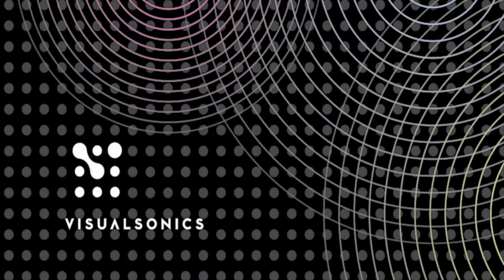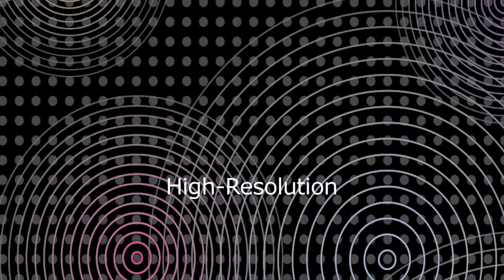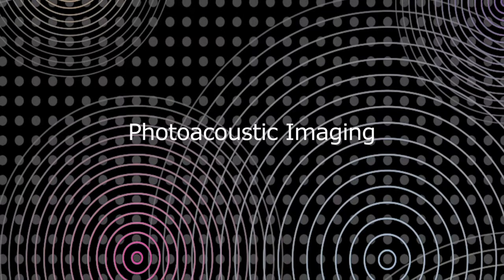VisualSonics is the world leader in real-time, in vivo, high-resolution microimaging systems, providing modalities specifically designed for preclinical research. You can now listen to the light with photoacoustic imaging offered by the new Vevo LAZR system.